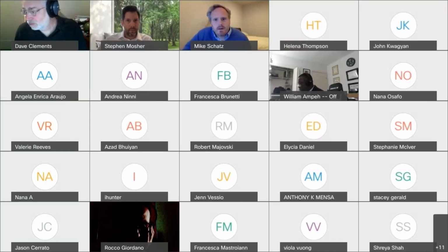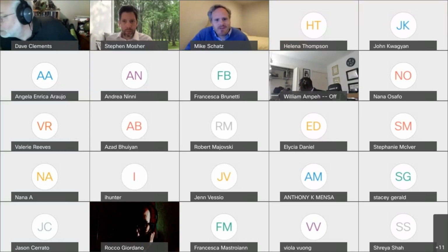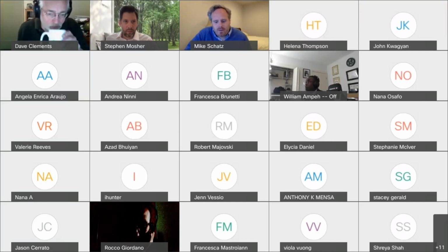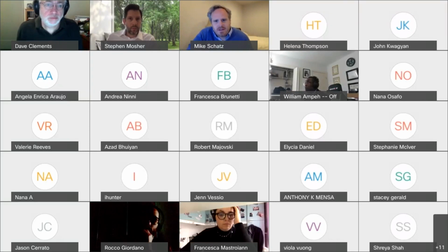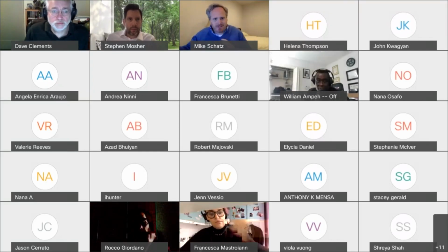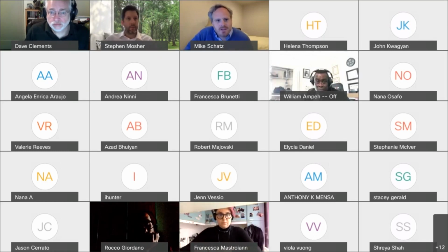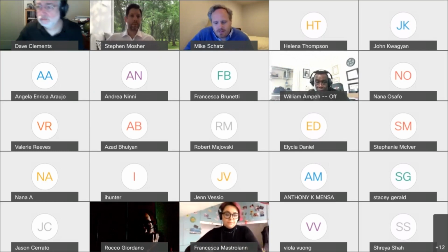Okay, thanks, Dave. Thanks for that great setup. We just saw how to launch Galaxy. In reality, it was just a handful of clicks to get it running. It does take a few minutes to get that set up. So what I'll do is give you a sort of classroom lecture about some of the genome analysis that can take place. My understanding is we have a very diverse class. Some people are very expert, some people are quite novice when it comes to genomics. Hopefully there'll be something for everyone in this presentation to walk through some of the concepts.